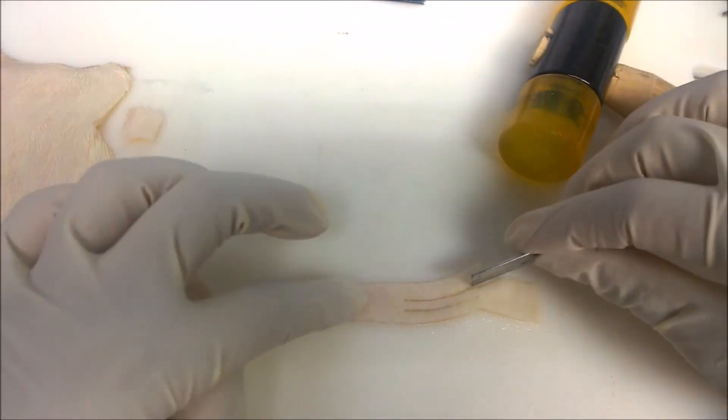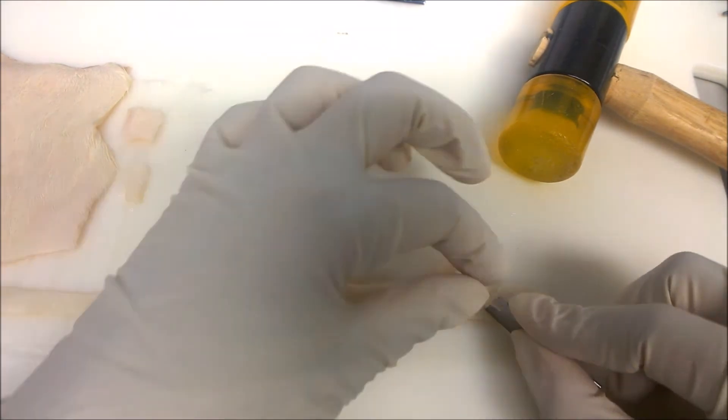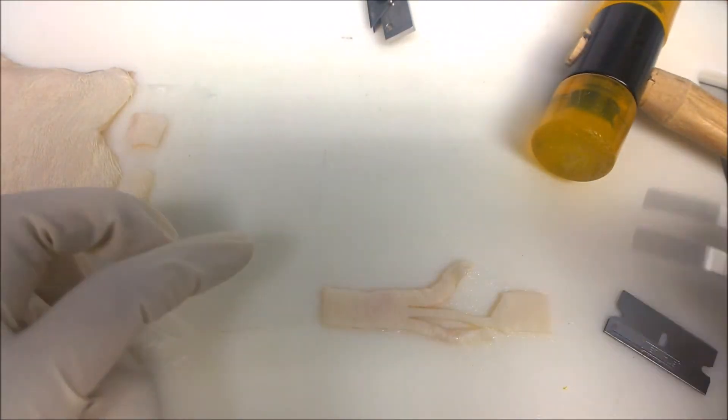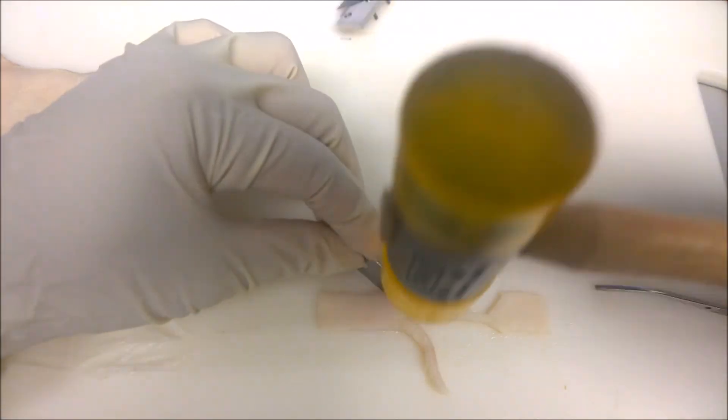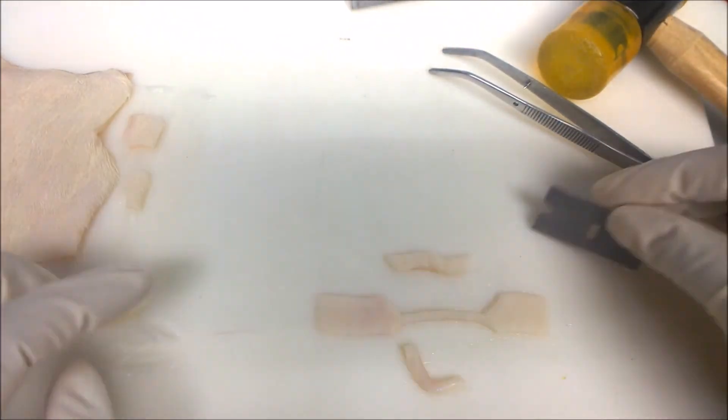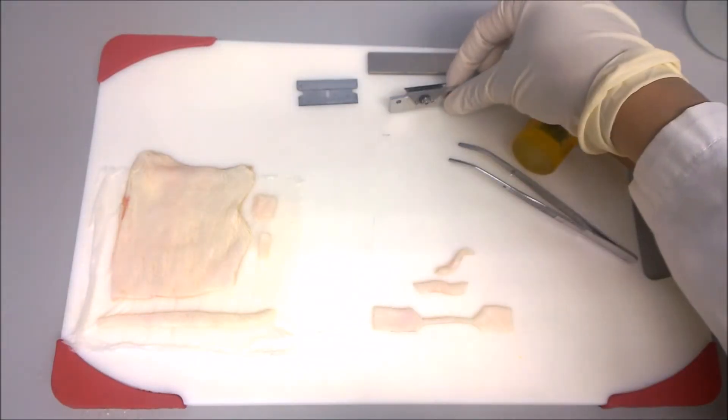Now position the razor blade to obtain a dog bone shape and then slightly tap the razor blade with the mallet to facilitate incision. Repeat this operation for the four diagonal cuts.